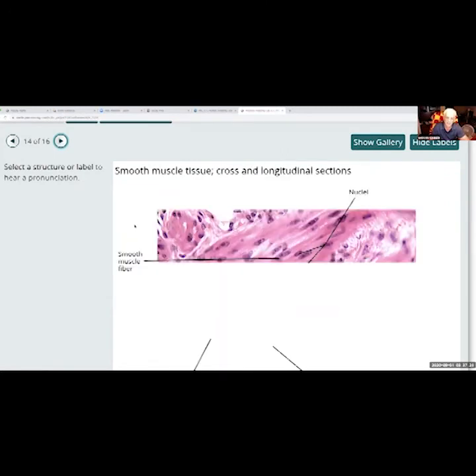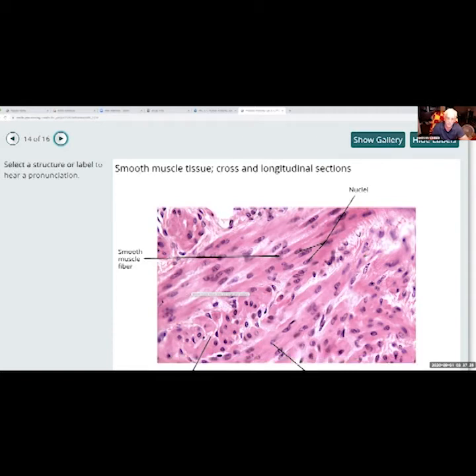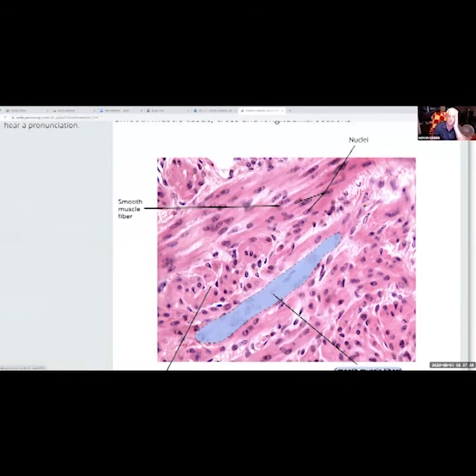That's even a better picture of it. Because if this was skeletal muscle, you would see all these lines right here go in this direction. All these lines go in this direction. You don't see any lines. You see long, smooth, long muscle fibers here. All these long fibers with no striations. That's smooth muscle. You see them, and nuclei are splattered all through it. There's no organization with smooth muscle. Smooth muscle, they have nuclei everywhere. Okay? And no striations.